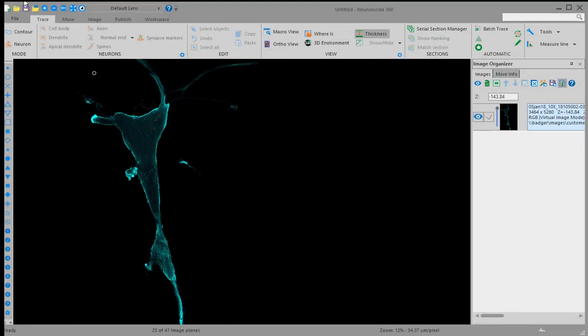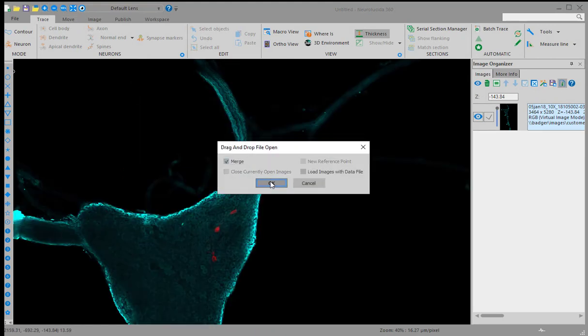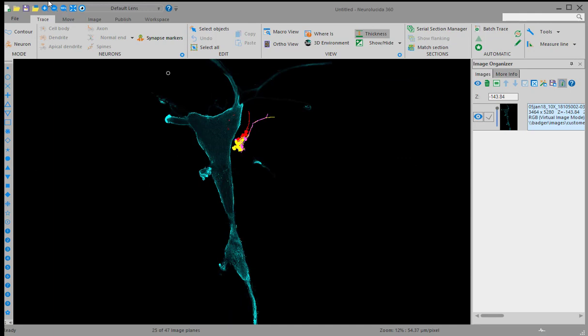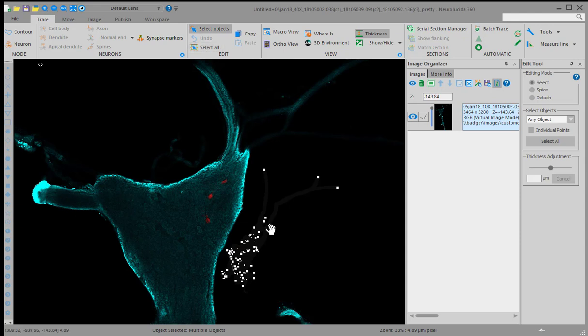The Topkins lab additionally imaged the whole stellate ganglion in 3D at 10x magnification. To put the backfilled cells into perspective, the high-resolution neuronal reconstruction was registered with a 10x image of the entire stellate by moving the tracing in the x, y, and z directions until it aligned with the low-resolution stellate image volume.